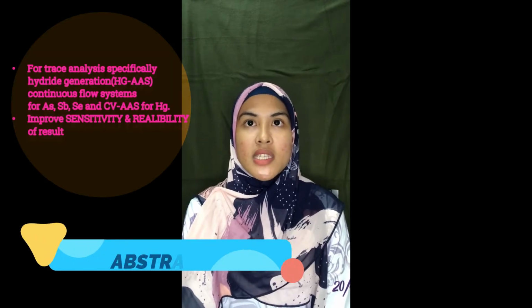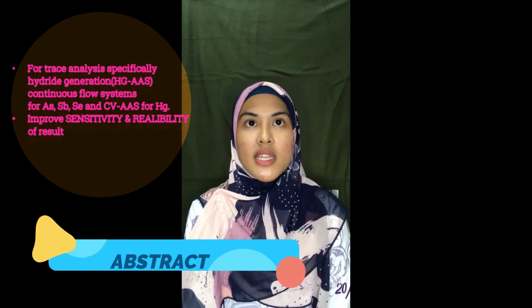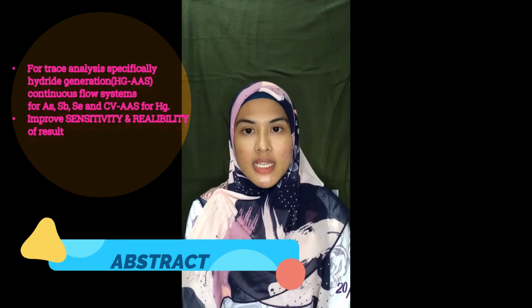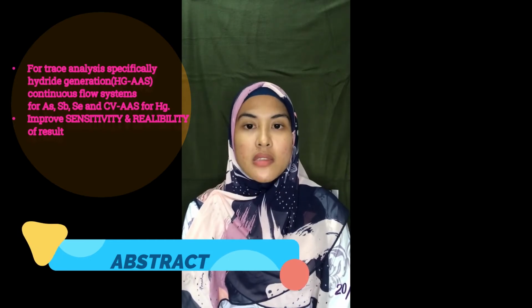Based on my reading, in the abstract, I have learned that the chemical vapor generation atomic absorption spectroscopy technique is the most popular for trace analysis, specifically hydride generation continuous flow system for arsenic, antimony, and also selenium. But cold vapor atomic absorption spectroscopy is used for the mercury.